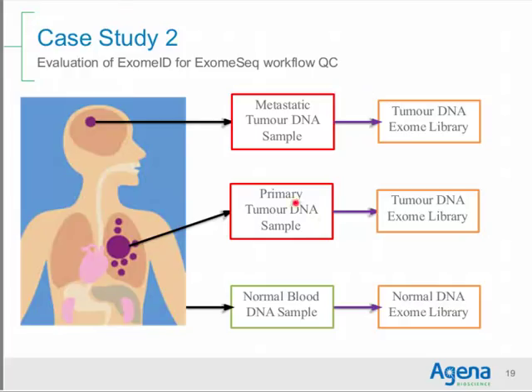We've mentioned before that tumour DNAs have the chance of loss of heterozygosity and copy number amplification compared to a normal germline sample, when in fact, next generation sequencing libraries have exactly the same possibility: biased amplification, which can be observed as loss of heterozygosity or copy number amplification. So effectively every sample, whether it be a tumour or a library, is being paired back to our germline sample using our tumour versus normal matching algorithm.